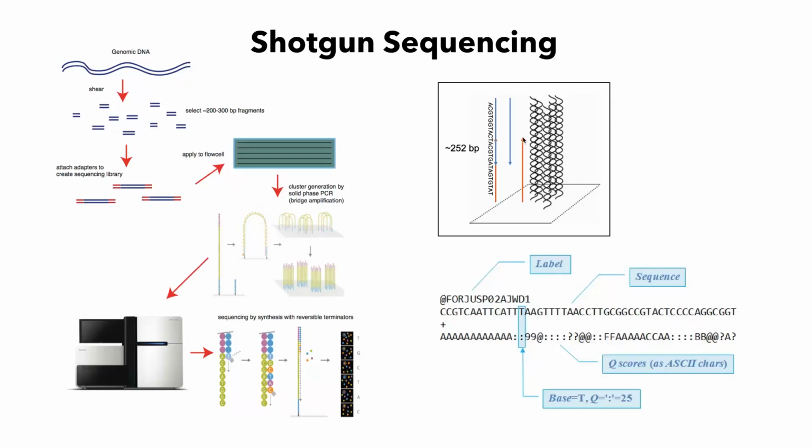If everything is consistent, then you're probably looking at a very reliable read of that sequence. However, those individual reads, the forward direction and backward direction, are going to be placed separately, so you do have to combine them together before mapping.